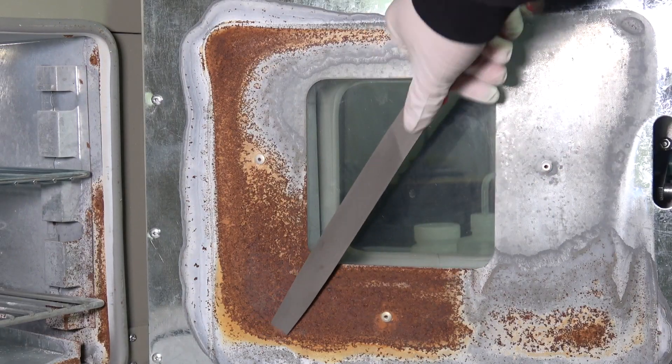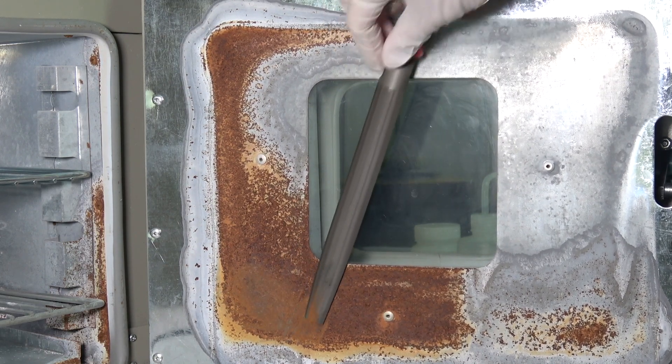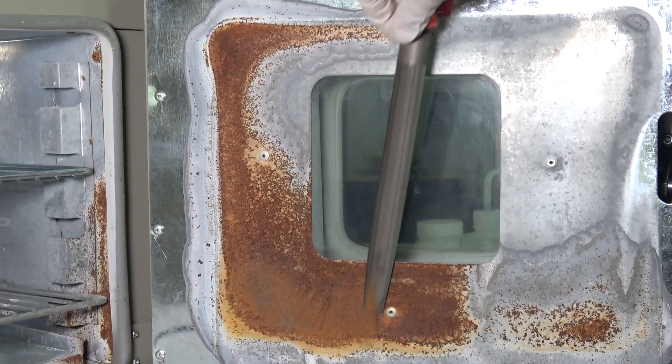I may as well just do a makeover so it will look more presentable in my upcoming videos. I remove most of the rust using a file before proceeding to the acid cleaning step.